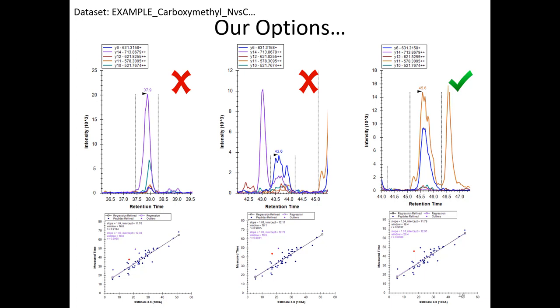But this was not an easy one to pick. The retention time is not so close, so again, kind of another exception to the rule. And if you don't have spectral libraries, this is difficult. It's not a very straightforward and easy process for all of the peptides. When you get those good ones, you're like, thank God. And when you get ones like this, you go, well, I'll just collect as many product ions and precursor charge states as I can and make sure that it tracks through the data and then figure it out from there.